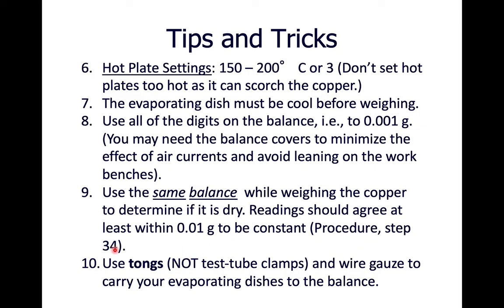This is procedure step 34. And use tongs, not test tube clamps. You can ask me, or you can ask your lab instructor if you're confused about this, and use wire gauze to carry your evaporating dishes to the balance.